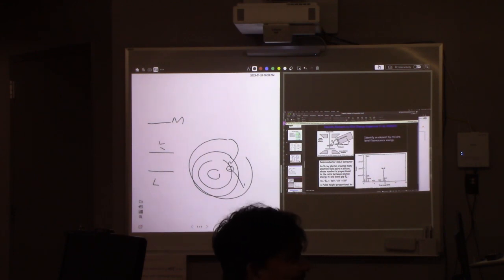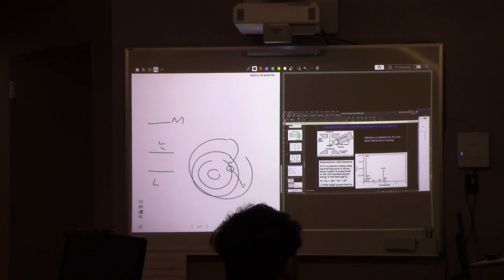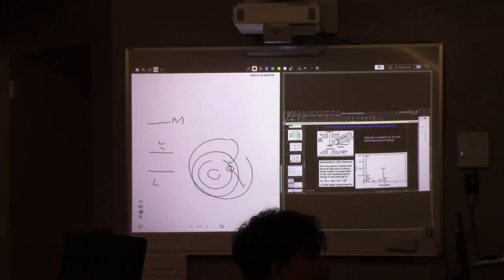Then also oxygen, because of the silicon oxide. The chromium showed two peaks, one from K edge and the other from L, and the same for selenium. These come from different orbitals, right? Everybody is familiar with these things, right?